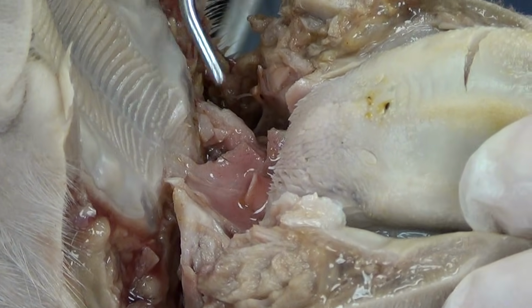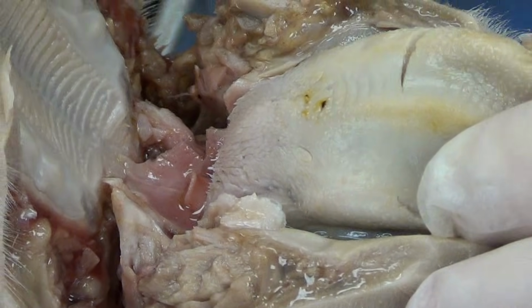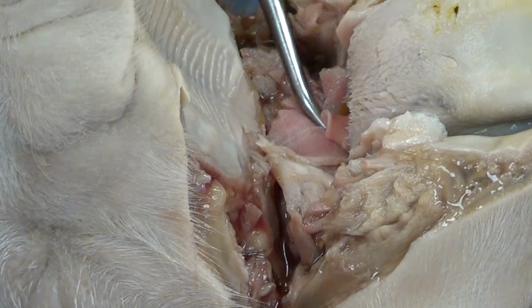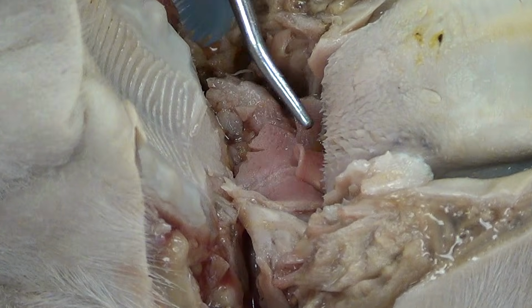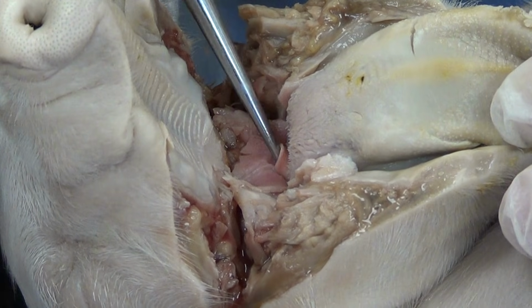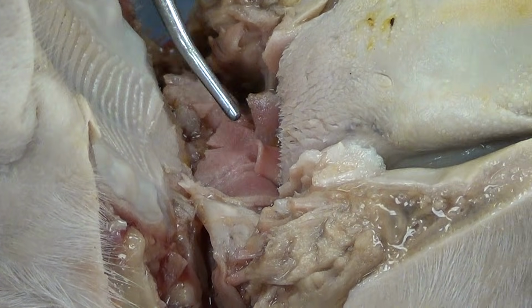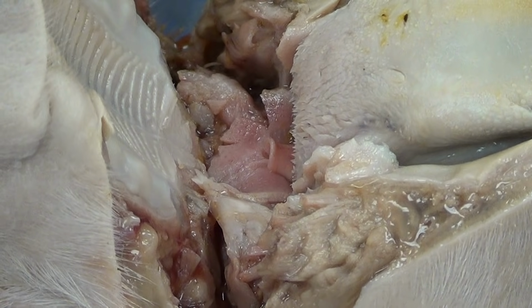Now you can see a small structure here that I've got the probe on. Let me go ahead and clean out some of that liquid. And you can see this little protuberance right here. That is going to be the epiglottis. Its job is to protect the hole in this structure called the glottis. The glottis is the beginning of the trachea, which goes down to the lungs. So the epiglottis is going to protect that hole from food getting into it.